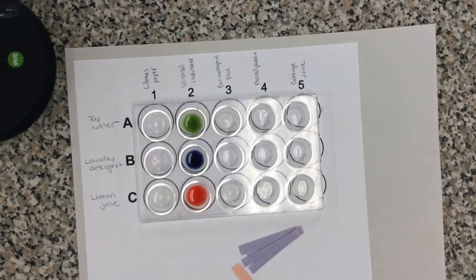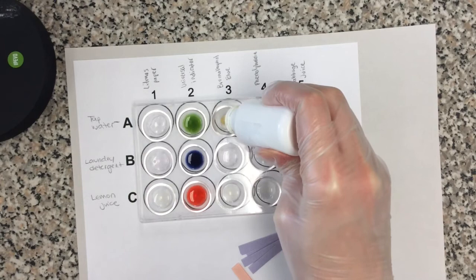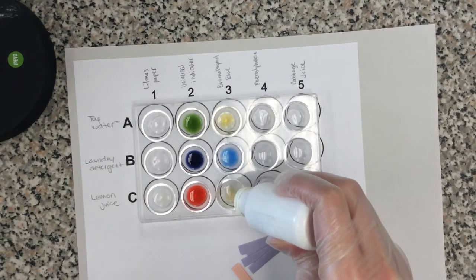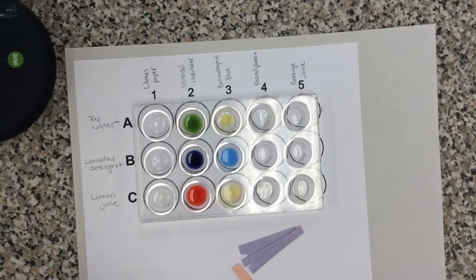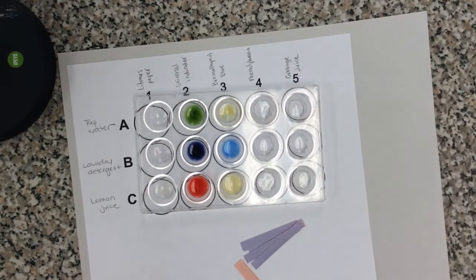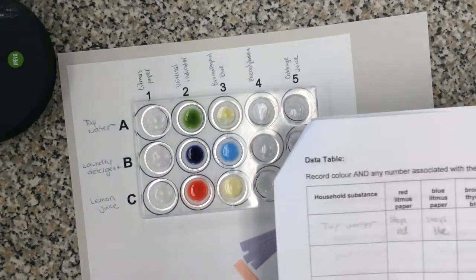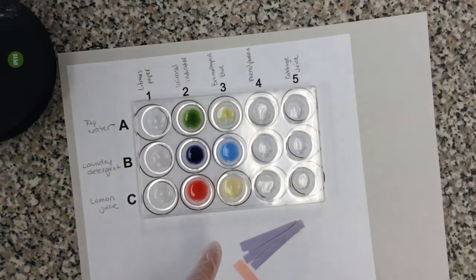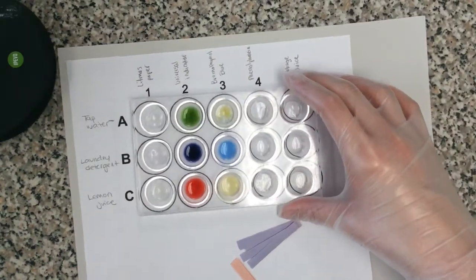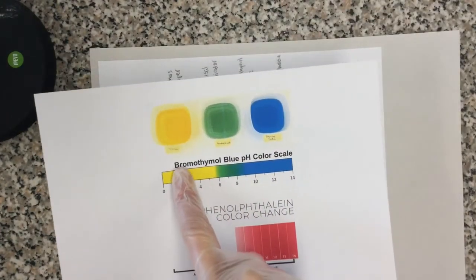So now let's go ahead and test out bromothymol blue. Okay. Give it a little swirl. All right. So with bromothymol blue, I have 2 different colors. They kind of have a yellow and a blue. And that's where you're going to now use your bromothymol blue pH indicator.